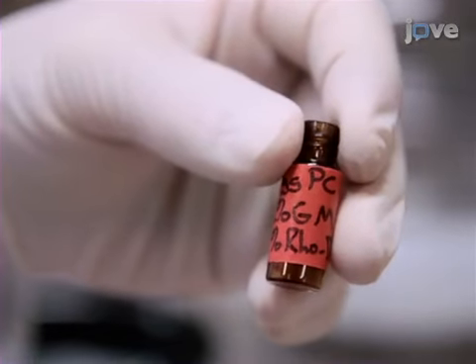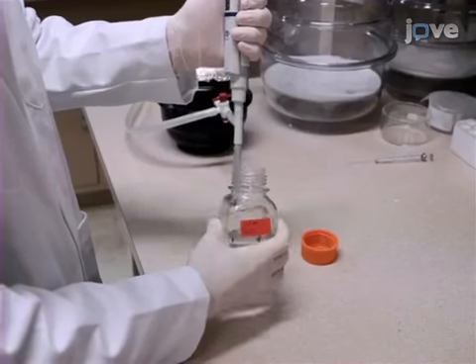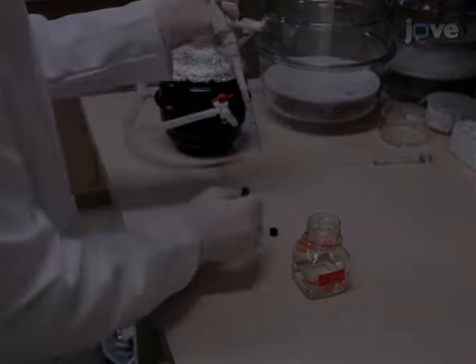Next, make a 0.1 molar sodium chloride solution and add 0.5 milliliter to the dried lipids. Allow the mixture to incubate overnight.